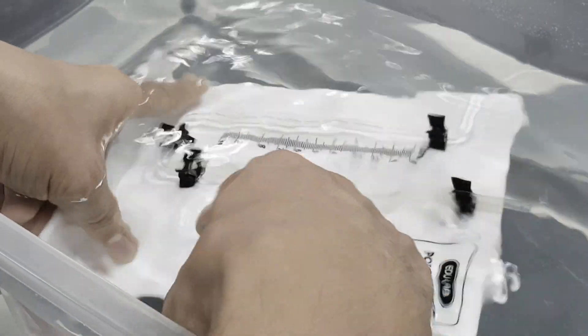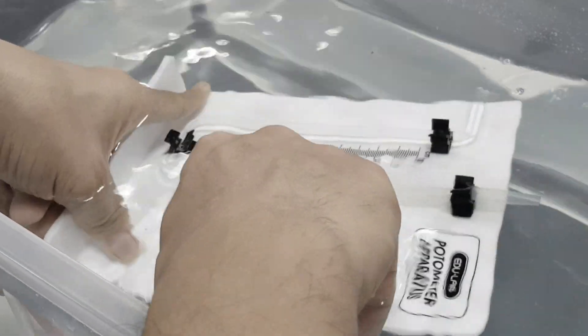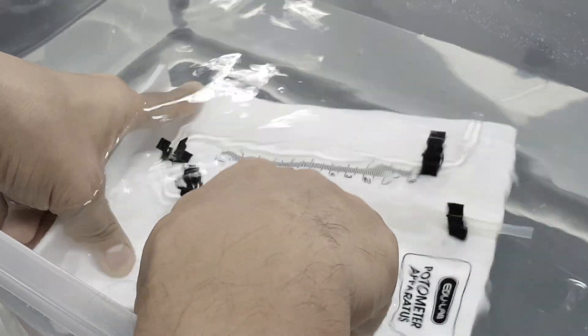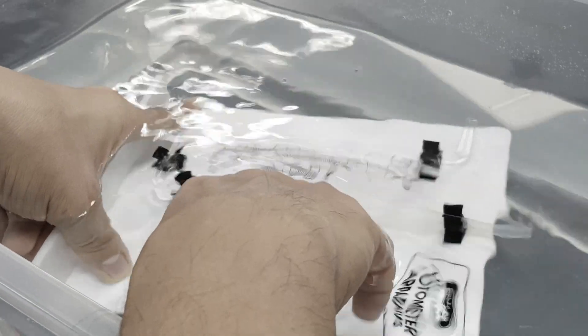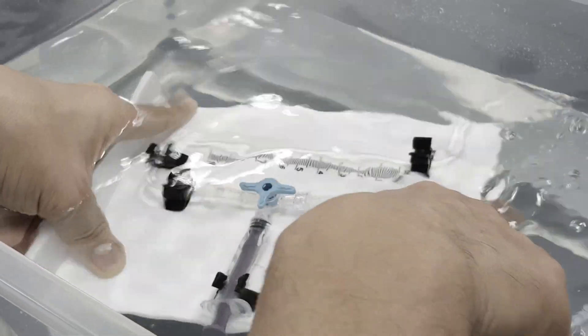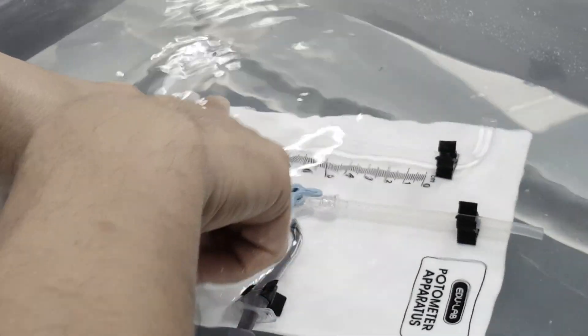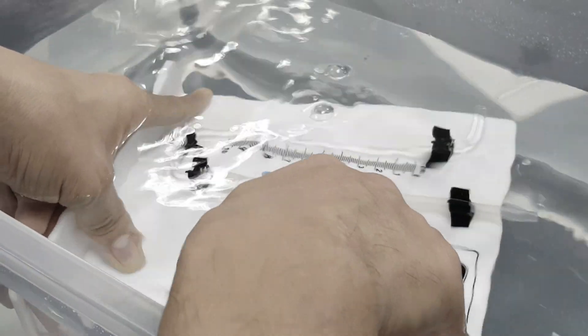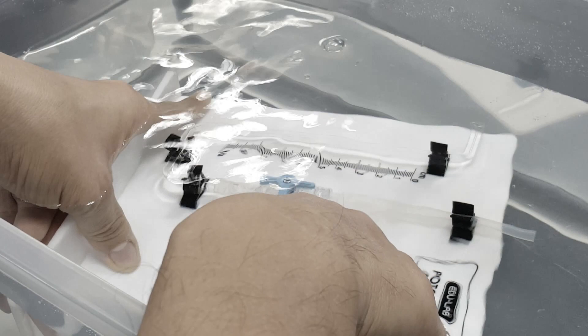Point down and point toward the syringe. Pump air out a few times to make sure there's no air bubble in this whole tube. Okay?